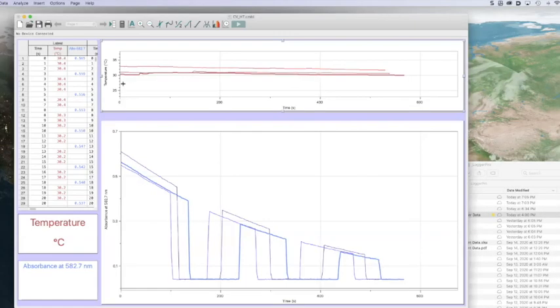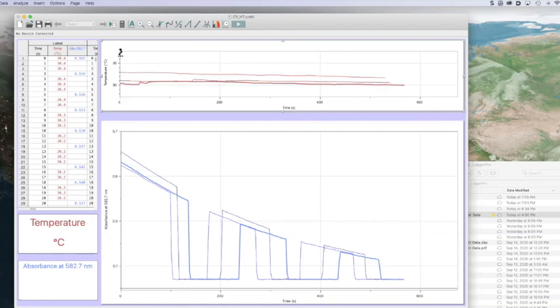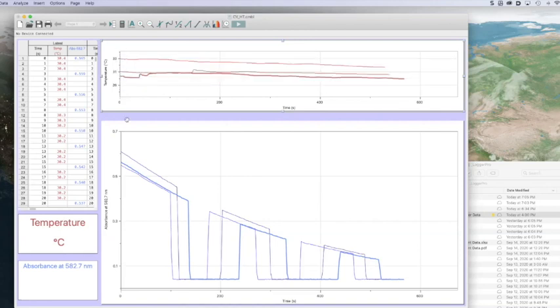When you zoom in on the temperature, you see that it's really not constant. There's actually a drift, but this is actually good. The temperature only drifts about 1, maybe 2 degrees. And that's actually good for this lab because throughout the years, it's always been difficult. I've seen students have temperature drift as high as 5 degrees.